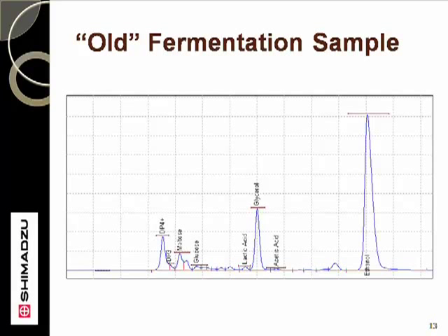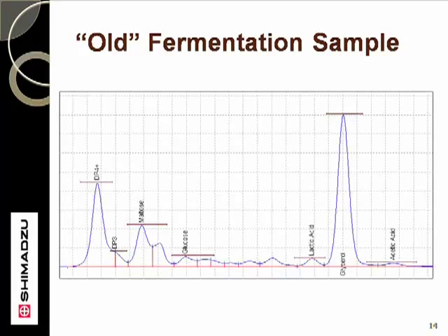Old fermentation samples have nearly run their course. The ethanol is very high and the sugars and starches have been depleted. This produces its own set of challenges in that during the fermentation, very many minor byproducts have been produced, and they represent the bumps in the baseline. With an interest in trying to report a specific number for a specific material, like glucose, the end user may be fooled by these minor byproducts.